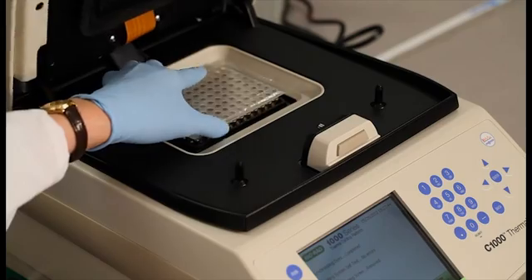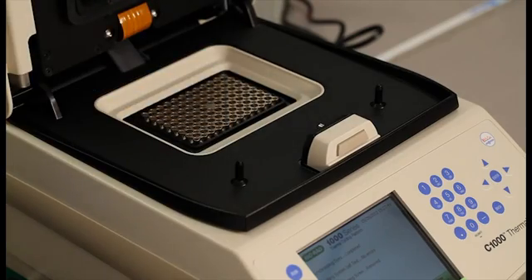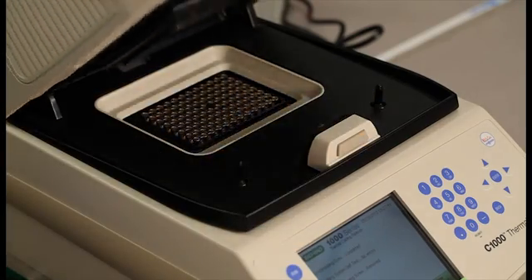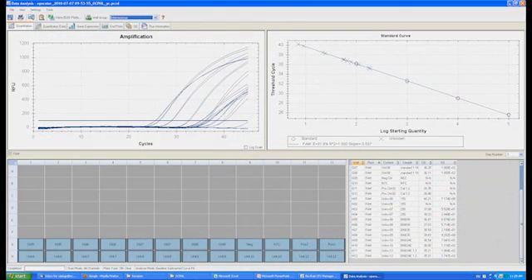When the run is finished, remove the 96-well plate from the thermocycler and discard without disturbing the seal. Export the data from the thermocycler to the pre-prepared spreadsheet. You are now ready to calculate your results.